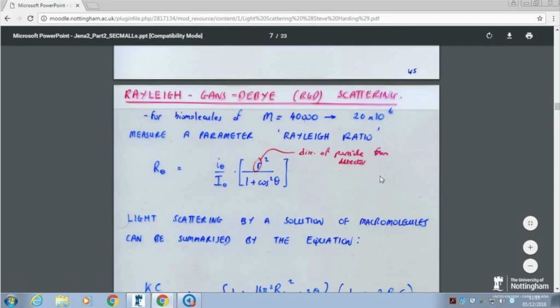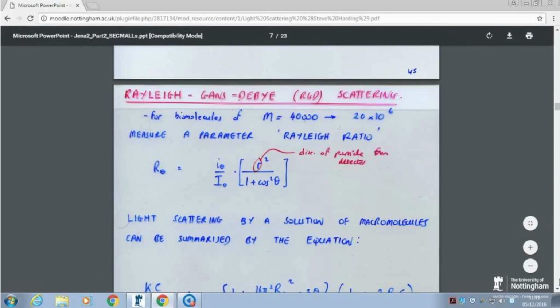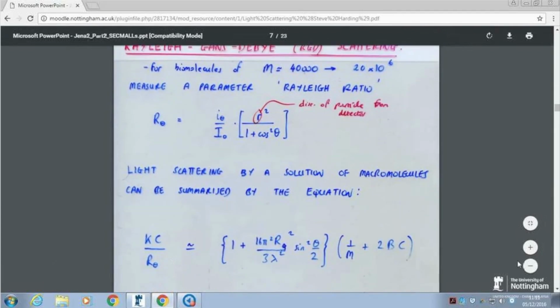And that includes really most of the molecules of interest to us. I mean antibodies, glycovaccines, all that stuff, xanthans, pectins, all these things, are all within this range.